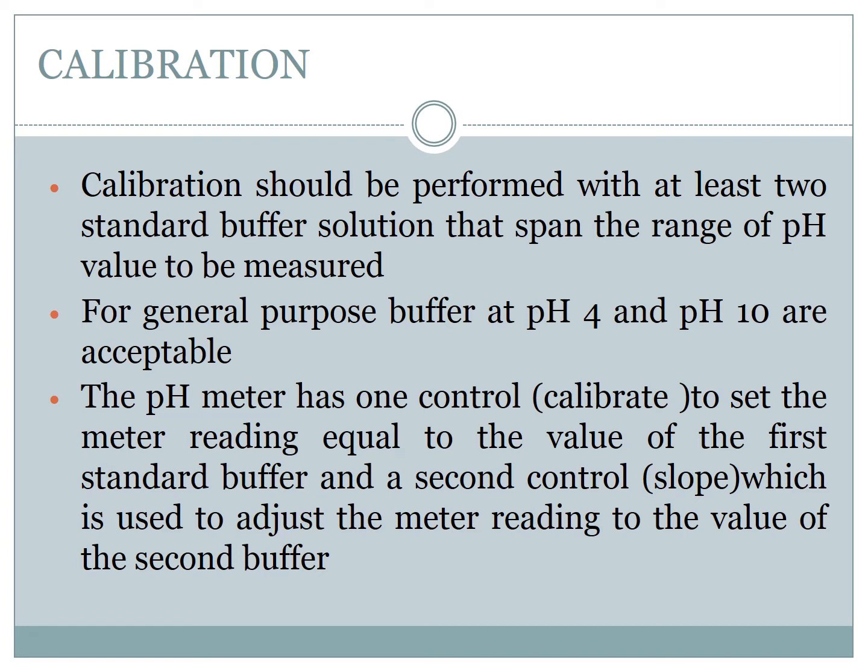Calibration should be performed with at least two standard buffers that span the range of pH values to be measured. For example, we need to check the pH of the given solution. You can take two buffer solutions of pH 4 and 10. That is an acceptable method to measure the pH.